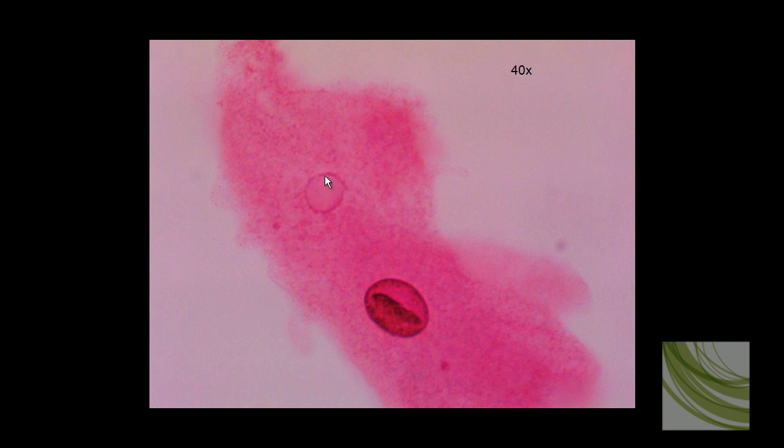The grainy substance is clear throughout this organism and we can see several pseudopods. I want to expand a little bit on this contractile vacuole. This organelle is very important in helping this animal maintain its shape and get rid of excessive water.